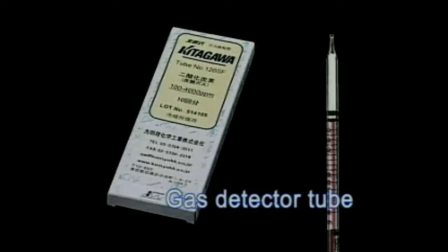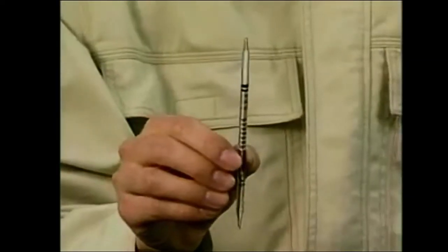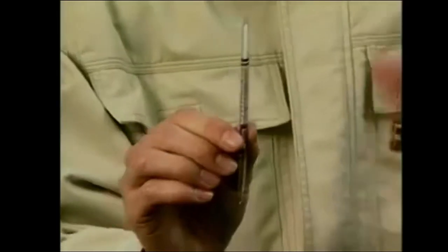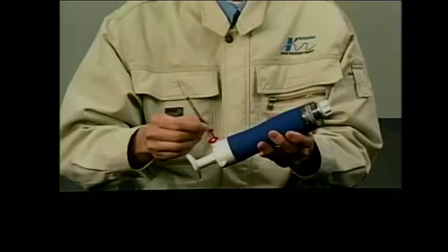We're going to measure carbon dioxide in the air using detector tube number 126SF. Start with a sealed, unbroken detector tube. Open the cap to the detector tube tip cutter. Hold the lower portion of the detector tube and insert the tip of the detector tube into the tip cutter.